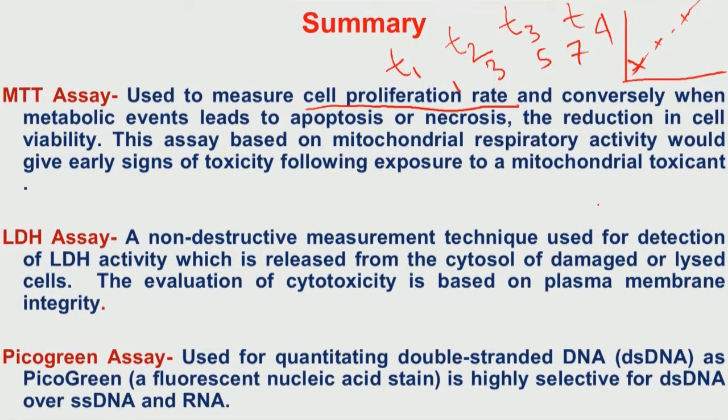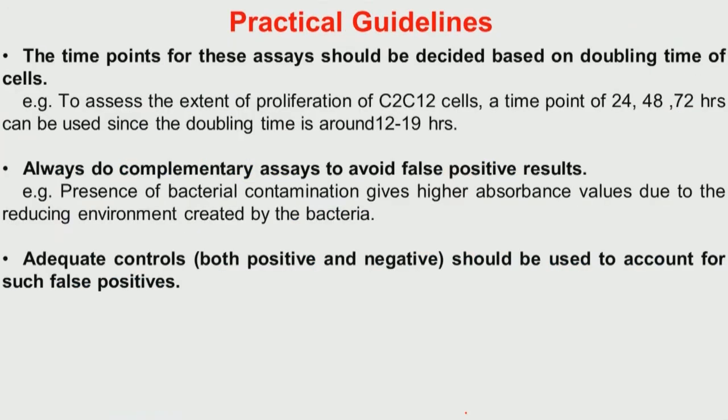When metabolic events lead to necrosis and a reduction in cell viability, this assay, which is based on mitochondrial respiratory activity, would give early signs of toxicity. The LDH assay is again a non-destructive measurement technique, and the increase in LDH activity in solution is essentially a measure of cell lysis. The PicoGreen assay is just to quantify double stranded DNA and is highly selective for double stranded DNA over single stranded DNA and RNA.